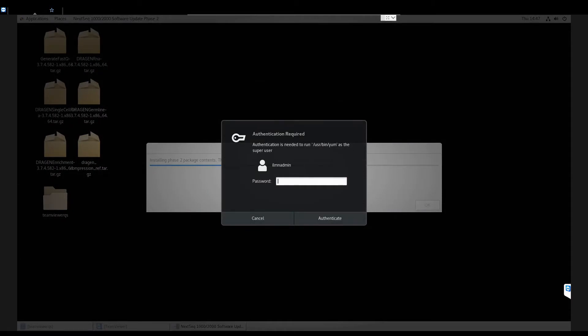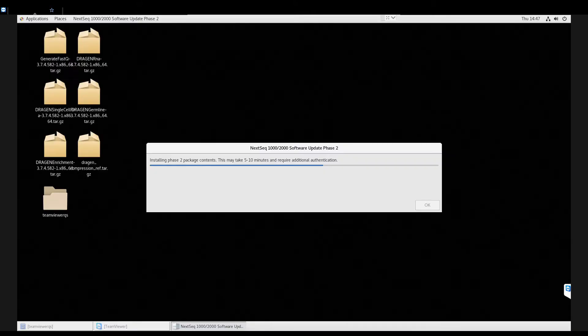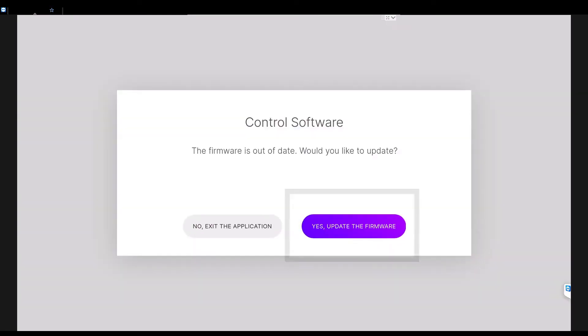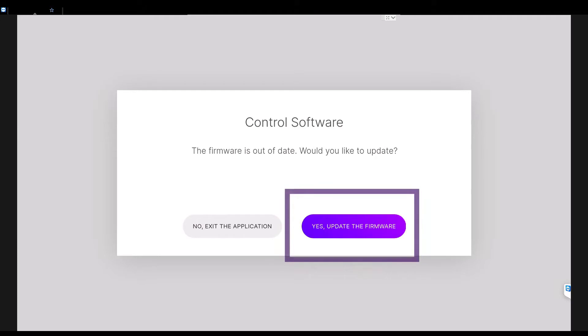If an authentication required box appears, type in your Illumina Admin password and select Authenticate. After the Installation Wizard is complete, select OK and the Control Software automatically restarts. After initialization is complete, a notice appears that the firmware is out of date. Select Yes, update the firmware.